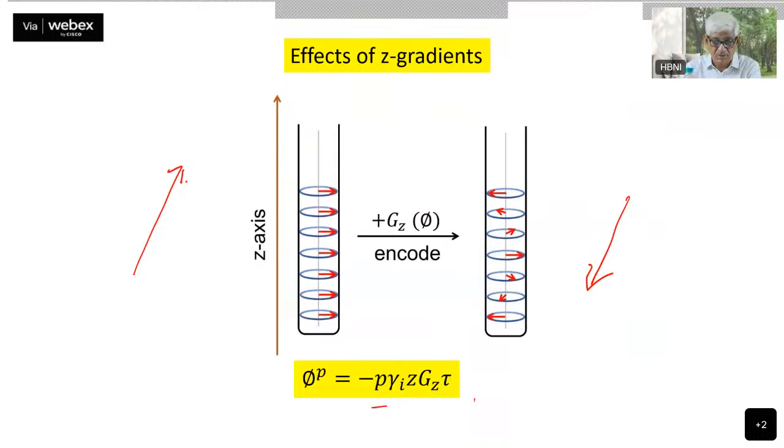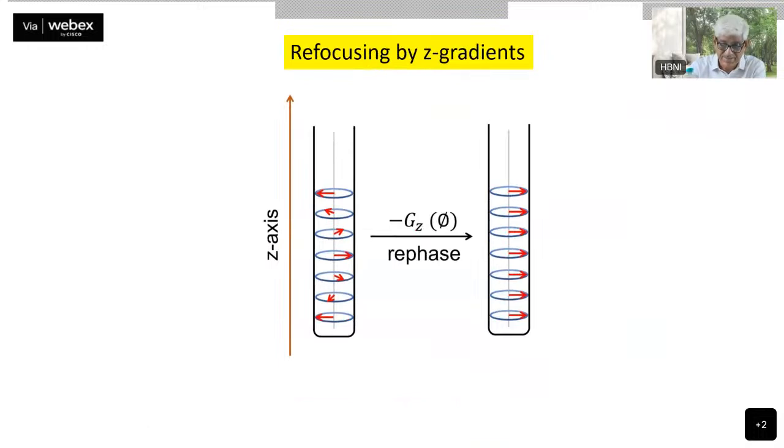So accordingly, they will be dephased out. So now, this is the phase encoding indicated here. The gradient is applied along one direction, which is the plus z phase. Now in the next one, see the minus z phase.